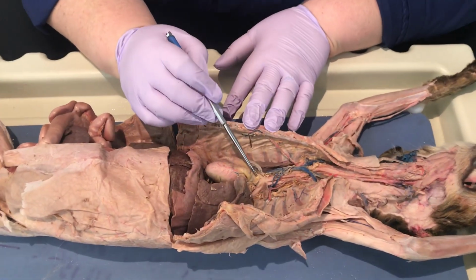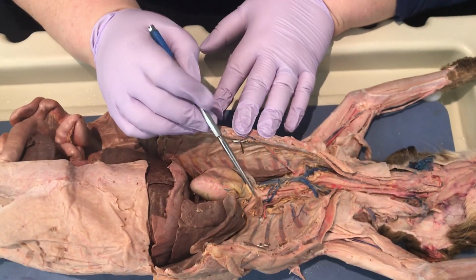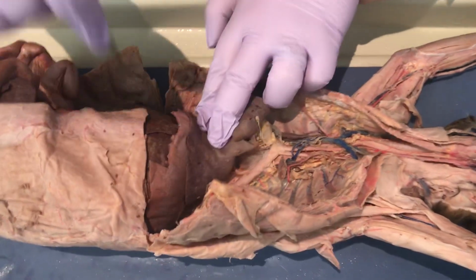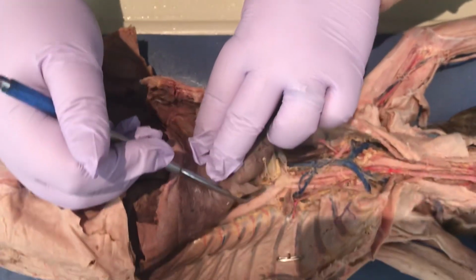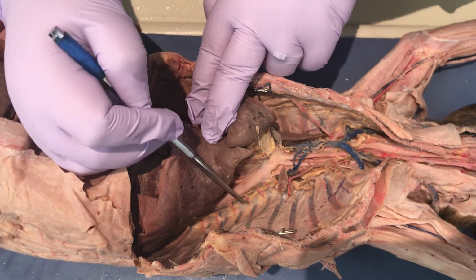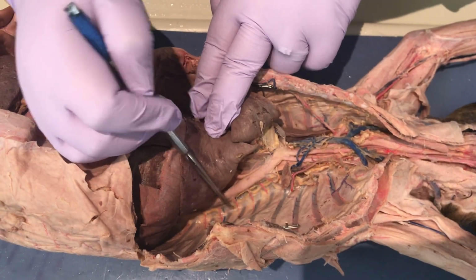All right, coming out of the top of the heart, we have the aorta. Aorta comes up, does a little U-turn, and will go behind the heart and lungs, and it turns into the thoracic aorta. Off the thoracic aorta are each of these little arteries. They're called the intercostal arteries.